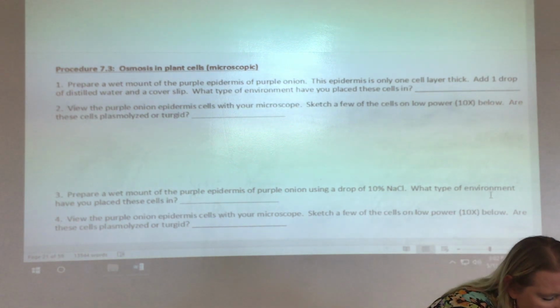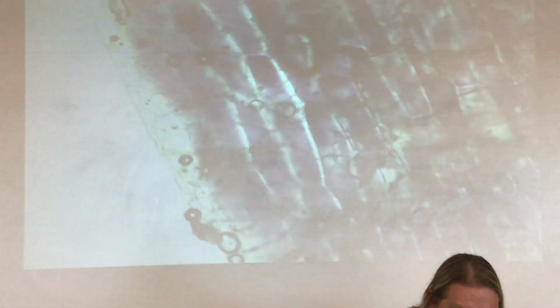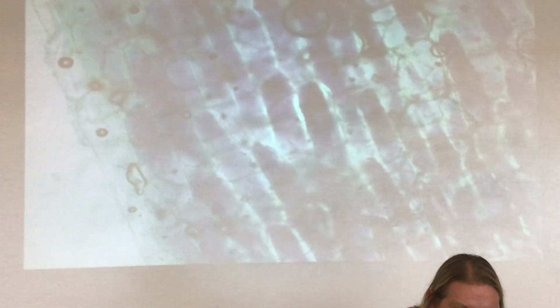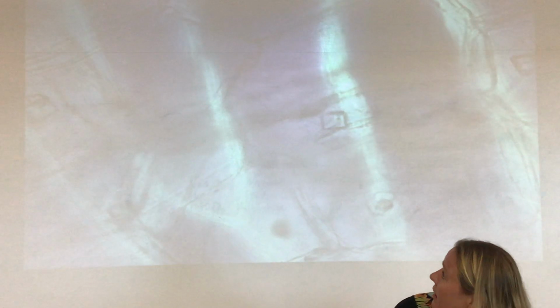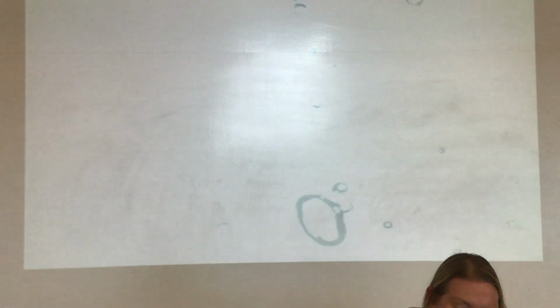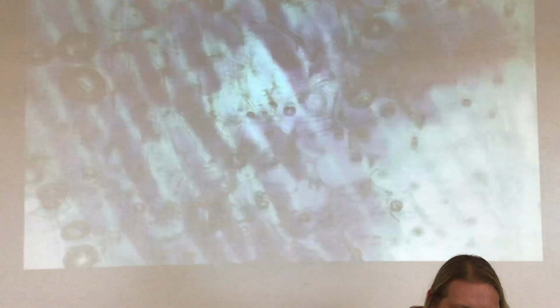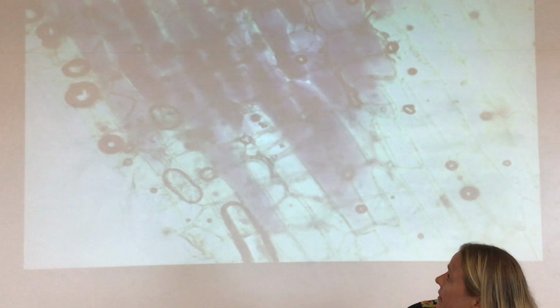All right, so I'm gonna put this on. See if I can find it. I got some air bubbles. I'm gonna try to find a clear spot where they are full. I'm gonna try to get close at first, and we may have to go back. That's too much. I'm trying to find a bright one. These all look okay, but I was trying to find the brightest one for you guys.